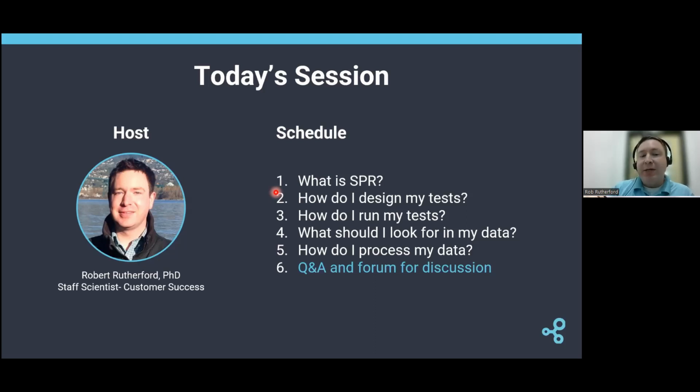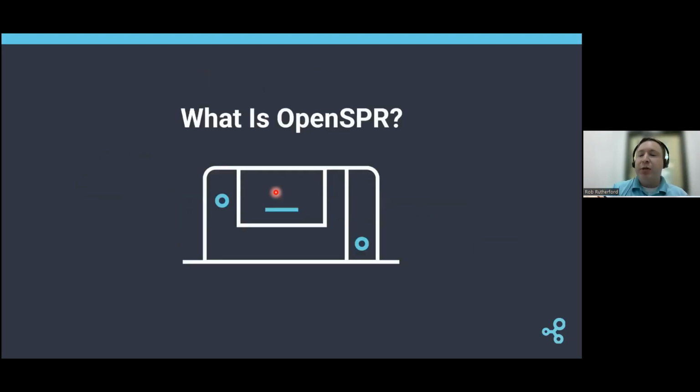So today's webinar itself, I've split it up into 5 main sections. We're going to start with the fundamentals. What is SPR? Why do we care about it? And then we're going to go more into the details of what considerations I should have when I'm designing my tests? How do I physically run my tests? And then once I've successfully run a test, what am I looking for in my data? Am I great? Am I getting a Nobel Prize? Or do I need to repeat my run? So by the end of today, you're going to be able to make that determination on your own. So we'll start with the basics.